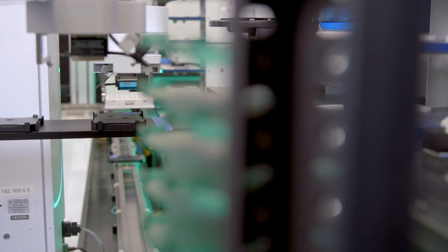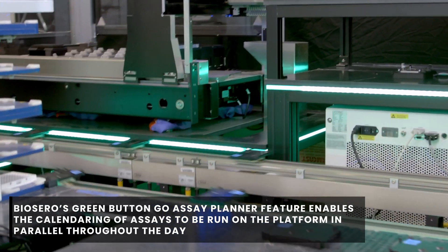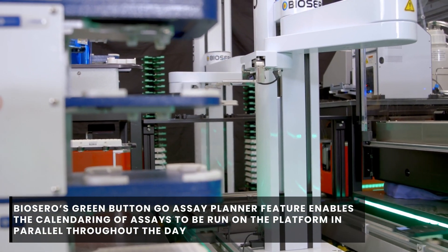This system is designed to be a high-mix, low-volume platform that allows for multiple scientists to run experiments on it at once. This allows for a much more collaborative nature in laboratory automation, whereas before, a single system would be designed for a single assay.